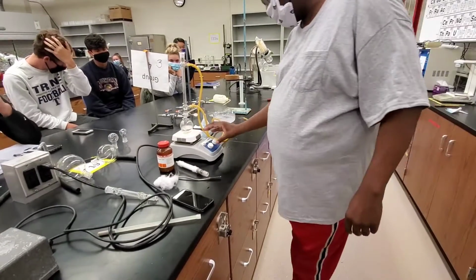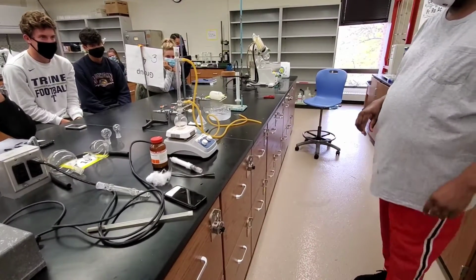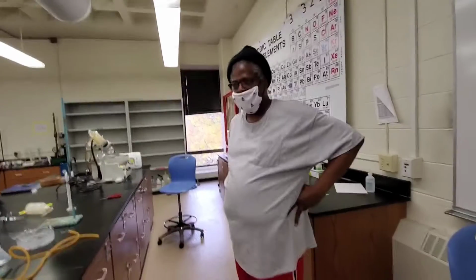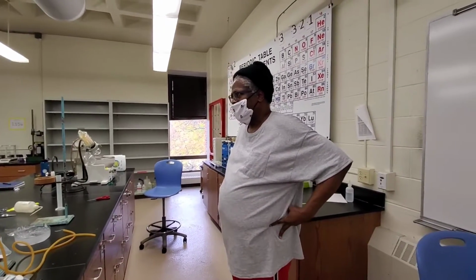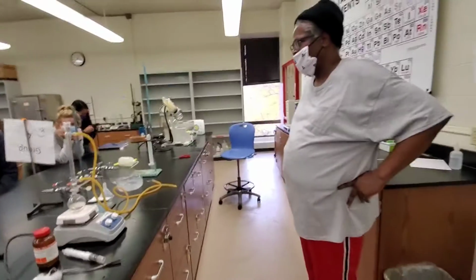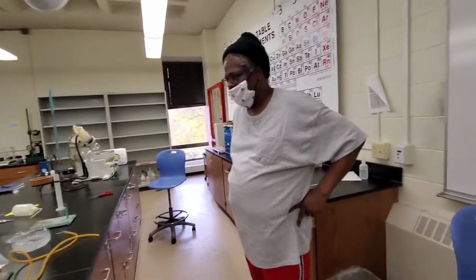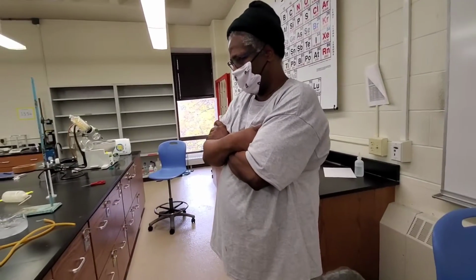So this, I don't want to really start heating here, it doesn't have water flowing. This is how we set up our reflux. Okay? So everybody, guys in the back, you need to come closer. If you're not seeing, yeah, you need to come closer. Okay? A lot of you are going to be doing this.